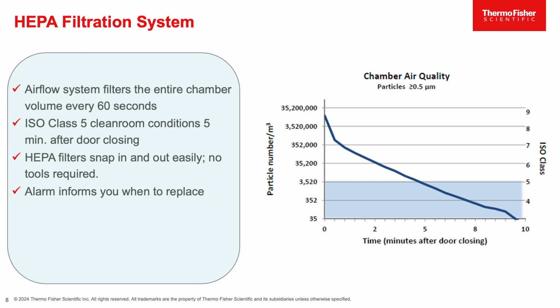Callie mentioned the ISO Class 5 conditions. That's 10,000 times cleaner than normal indoor room air, so you can imagine how well that helps protect cultured cells. Yeah, I mean, you did mention there's a lot of misconceptions out there, so thank you for debunking that rumor for me. There's so much to know about contamination control technologies.